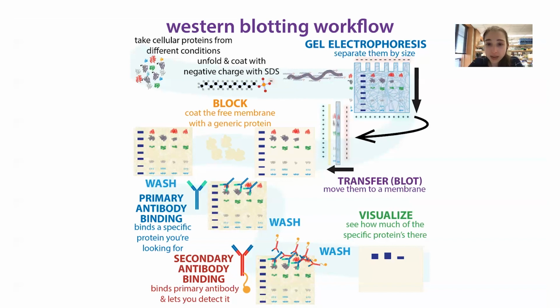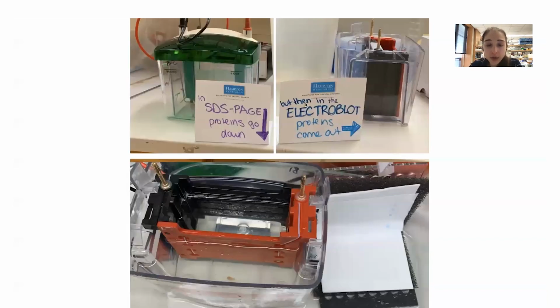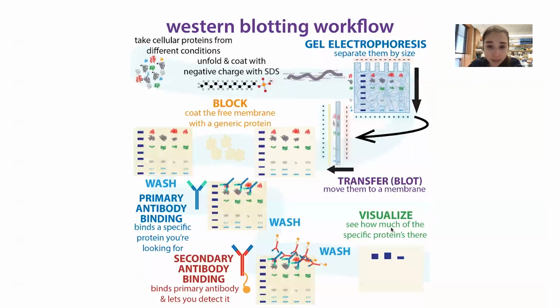And so how you do the blot, there are different methods. With Western blot, what I typically do is a semi-wet or wet transfer blot. Basically this is an electroblotting technique where you use electricity. Before, we were using electricity to send things down through the gel; with this electroblot, we're taking the proteins out of the gel and onto this membrane. So now we're going in the other direction, out of the gel and onto the membrane. We do this by making a sandwich, and I have more on Western blots in other posts, but this way you're basically transferring the proteins onto the membrane.